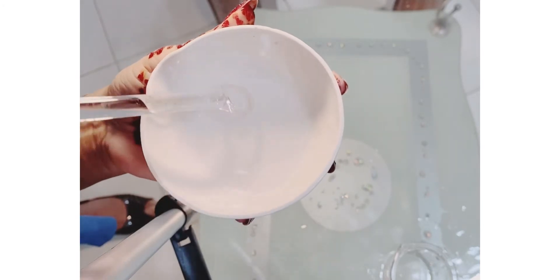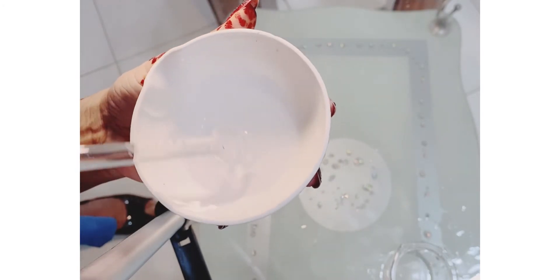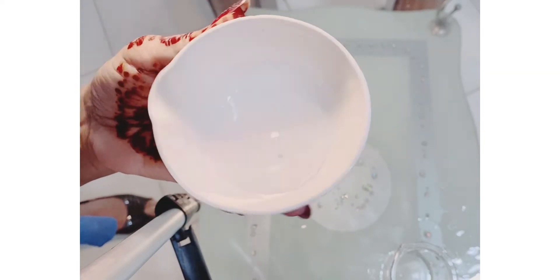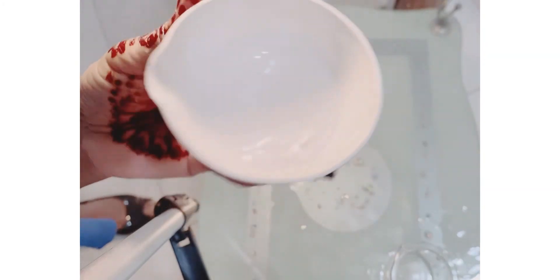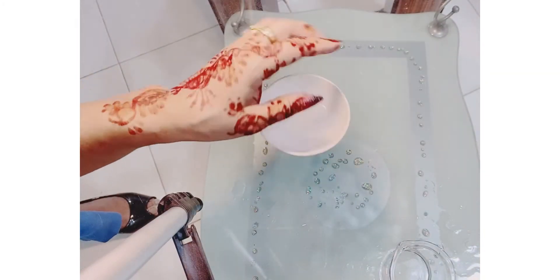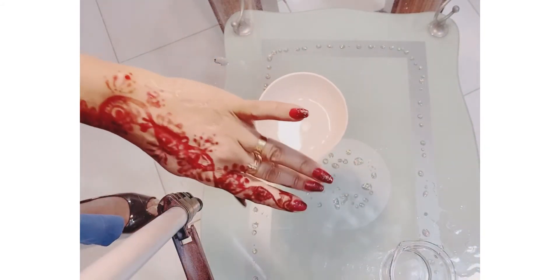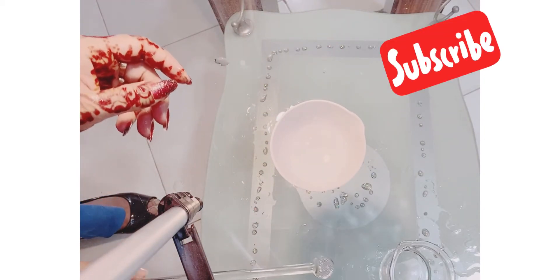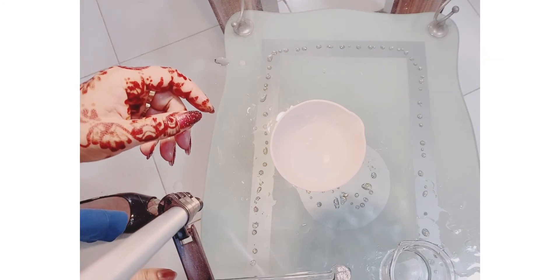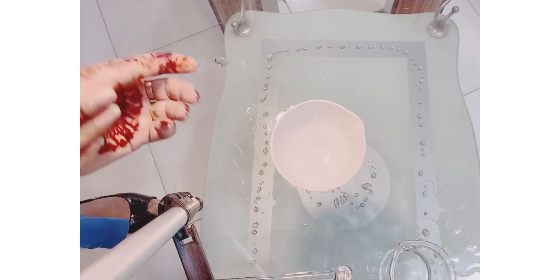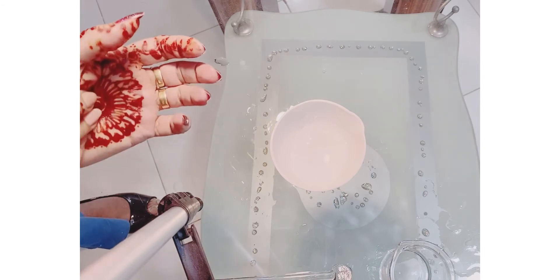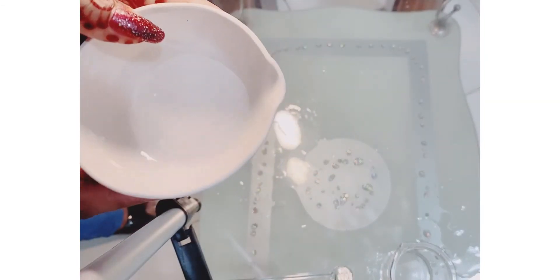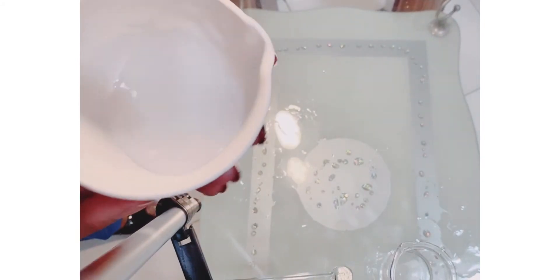Because the harsh swirling or the stirring of the solution in this dish will cause - what will happen if the solution will be spilt? And you can see here, half of the solvent is spilled on the table. It is on the table, right? So do not - it's better to avoid using the stirring rods, the glass rods, for simply swirling the solvent that is contained in this china dish.